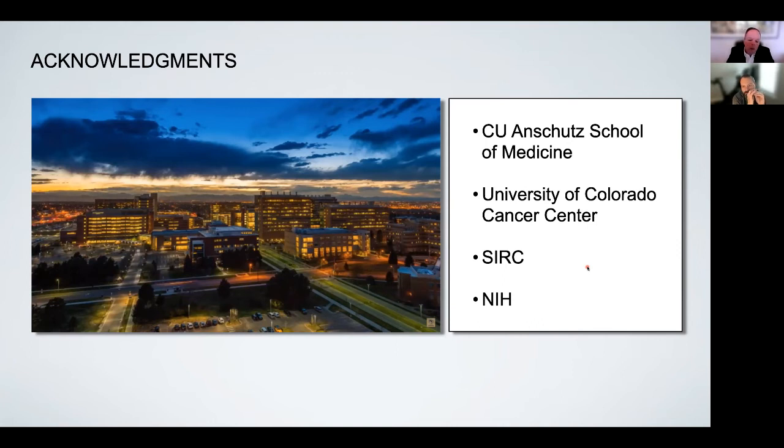Yeah, good morning, Jim. Thank you for the question. So for the initial stage analysis in stain, that's, like I said, very straightforward. Typically, it starts with somebody getting in touch with me, and then I coordinate with Eduardo, our manager, to look at your samples. You would then bring, to give you an idea, perhaps 20 microliters of your sample at 100 micrograms per mil, so a very small amount of material. And we can do the imaging and calculate the averages in stain for you.